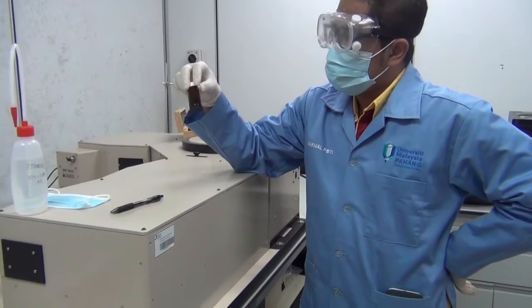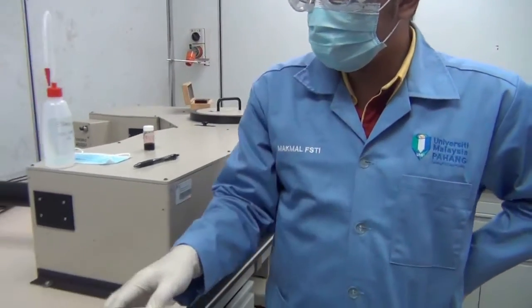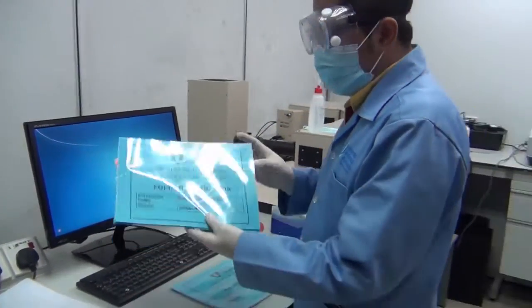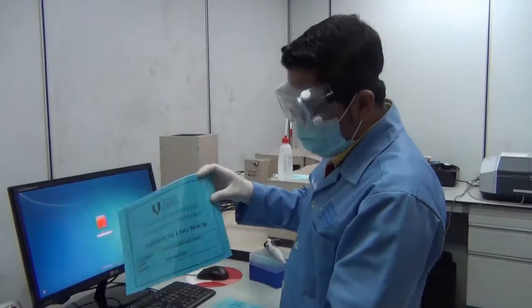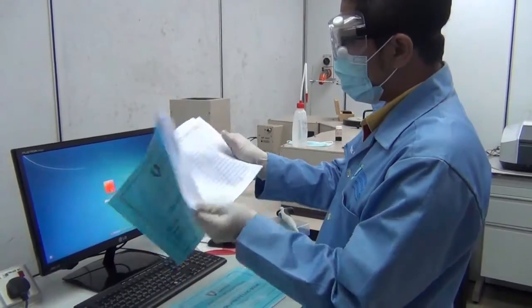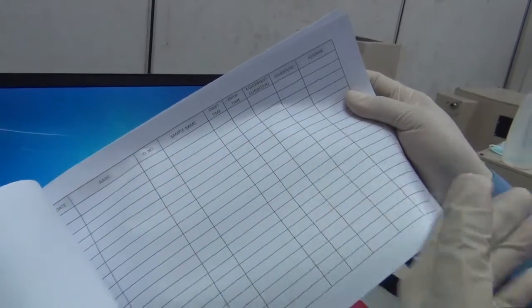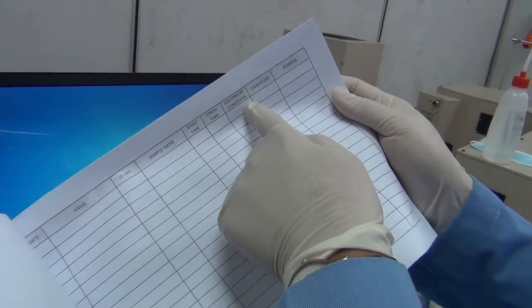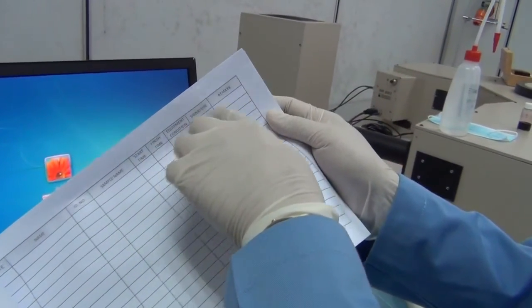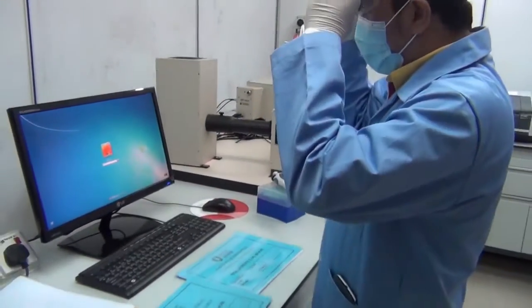Now what do we need to do? Alright, let the dye be over here like this, and I need to start up the machine. The password will not be given to you, and make sure you always write your name in the logbook. The logbook is here. So write down your name. What else is needed? Date, name, ID, sample name, follow your laboratory manual, start time and finish time, equipment condition. If the equipment is okay, just write down okay, your signature, and remarks if you found any difficulty using the instrument. The password won't be given.